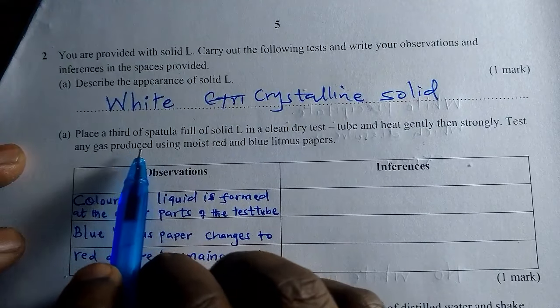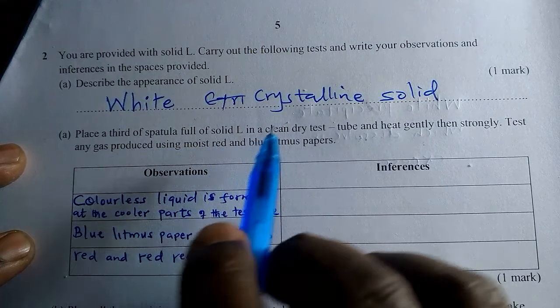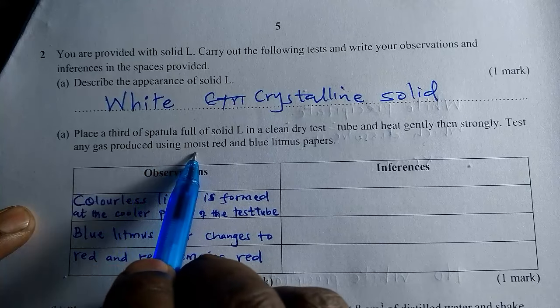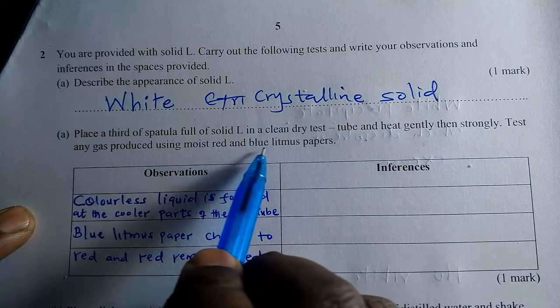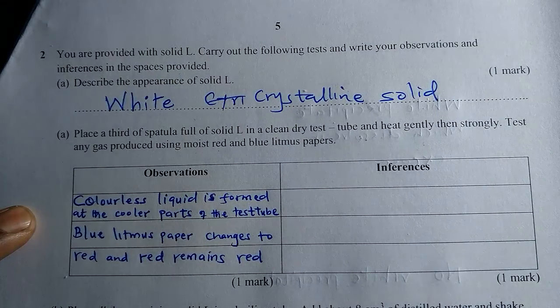Place a third of the spatula full of solid L in a clean dry test tube. Heat gently, then strongly. Test any gas produced using moist red and blue litmus paper. You dip the litmus paper in distilled water, then put it on the mouth.